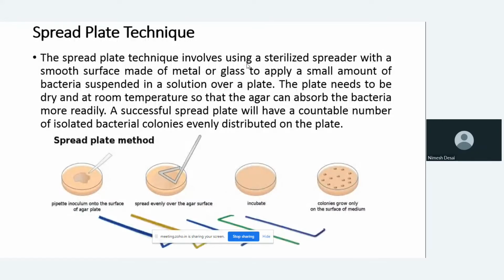Here I am going to explain about pharmaceutical microbiology laboratory techniques. There are a few techniques, and following these techniques, we are going to perform a few tests in the microbiology laboratory. One by one, we can go through them in depth.